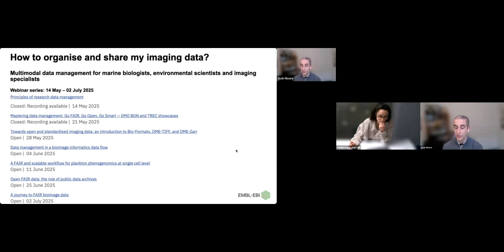I think it's actually a fairly similar story to working together with the companies: various groups have ways of representing the metadata in their own way. Certainly it's a good starting point to just find a place to put it in the file format, so in the OME-Zarr, and save it, send it to us. But that is human readable, and what we need to get to is machine readable. We will need to have the language for groups like RIMBY and Bioimage Archive, and maybe particular, say, marine communities or the volume EM community, a way for them to write down their data and store it in a machine actionable way. But we should definitely get there. Agree completely.